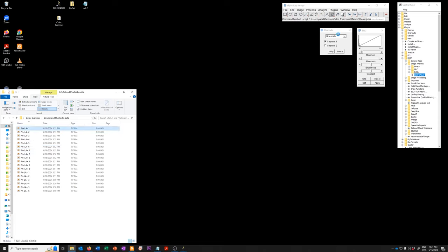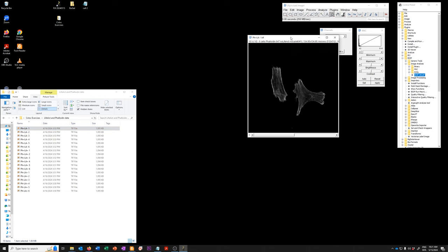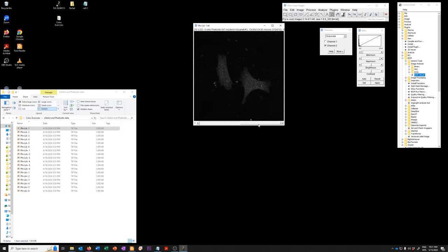So if I open one of the negative controls, the first channel is phalloidin where you can see the filamentous actin, the second channel is LIFACT and this is just background levels of signal in the absence of LIFACT.